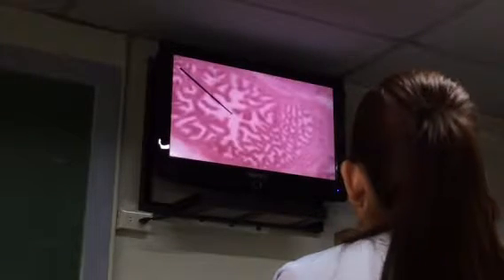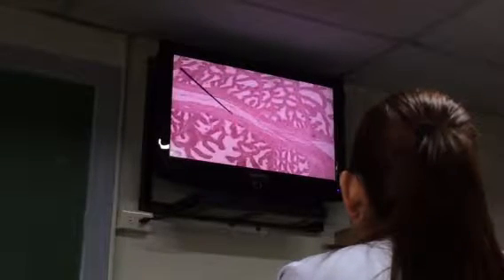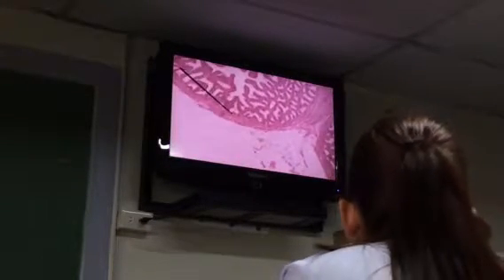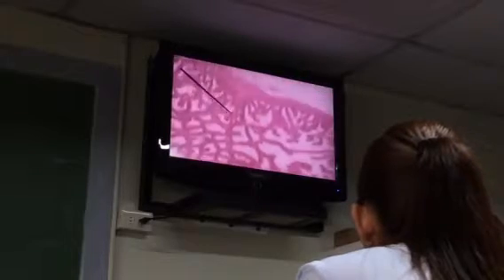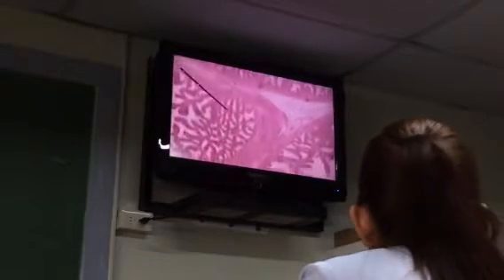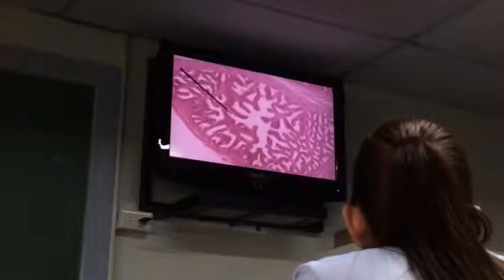The next slide is slide number 70. Okay. When you see this organ, this is one seminal gland. From here to here, that's one gland. Another one here. So this is one seminal vesicle gland. What are you reminded of when you see this? What does it look like?